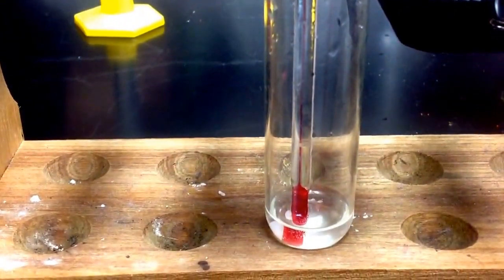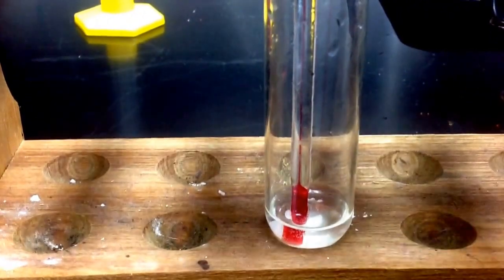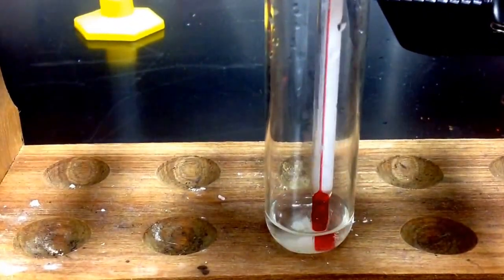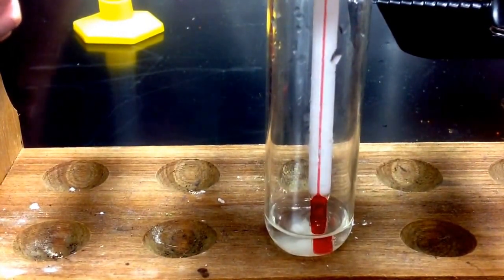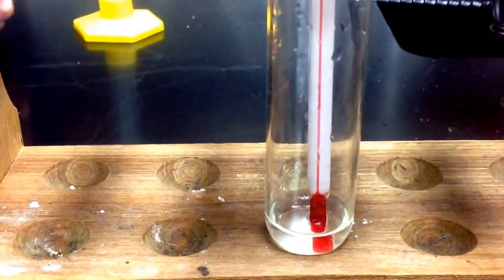Oh, I see. It's like rising up a bit. Well, turn the thermometer until you can see where the red is. It's almost to 33 degrees. It's rising up a bit every time.